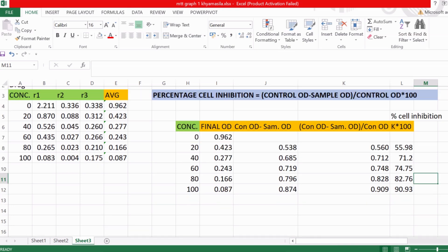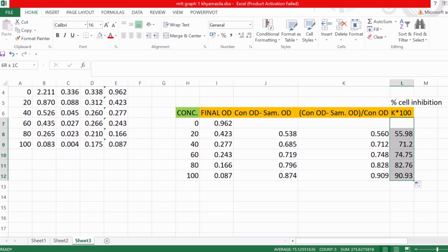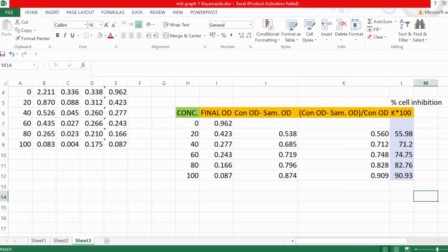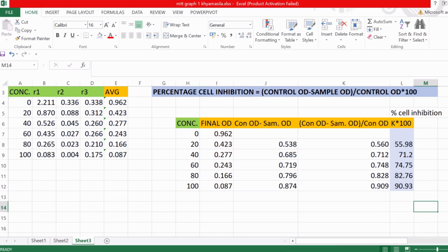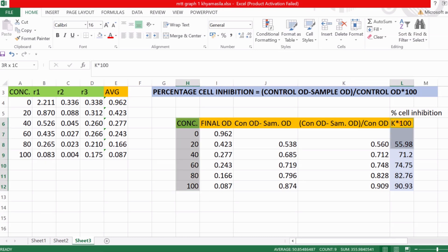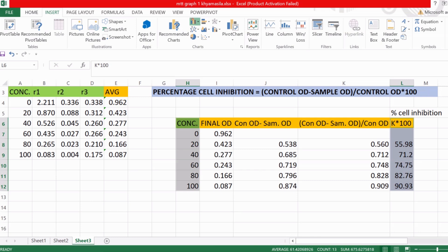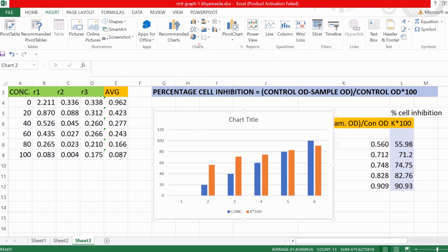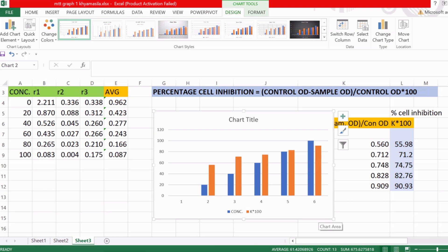Now I'll give it a color so it will be clearly visible. This is how you find the percentage cell inhibition of this data. To make a graph, select the concentration column and the percentage cell inhibition column, go to Insert, go to 2D column, and select the first one. The chart that appears has an X-axis showing 1, 2, 3, 4, 5, 6, so we need to change it.